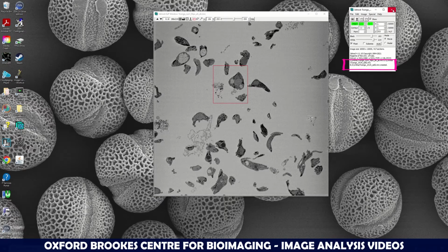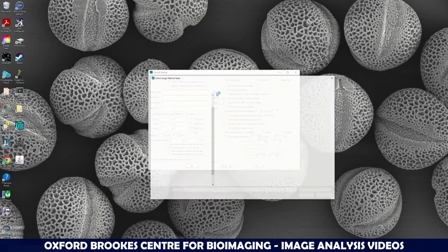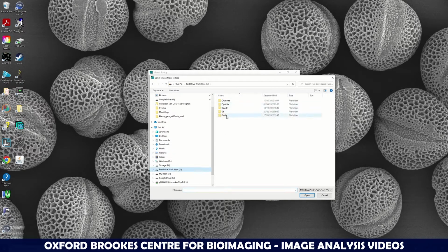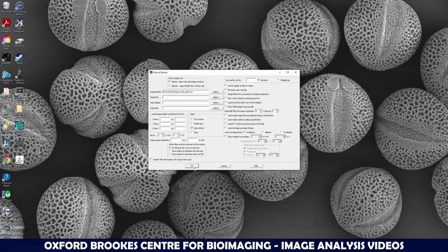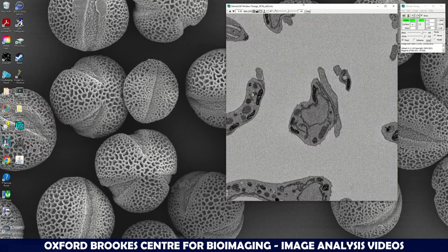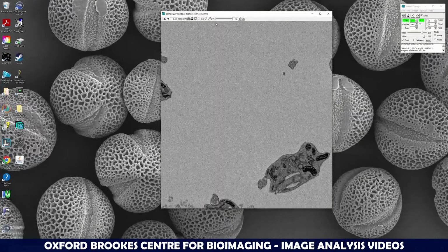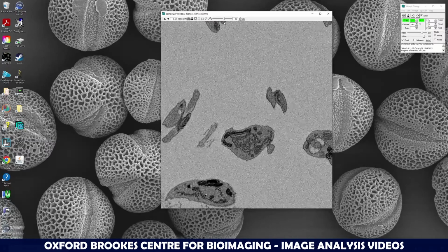So what you should do is then, to start modeling, you close the large volume and you start 3D Mod again, and then find that smaller file that you created, select it and open it on 3D Mod, and then hopefully you will have a smaller file just with a cell that you would like to model.